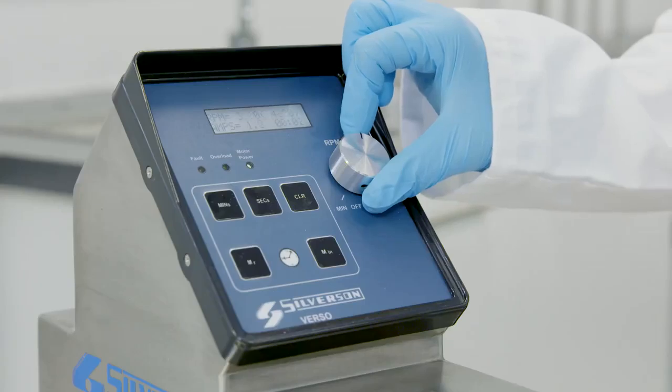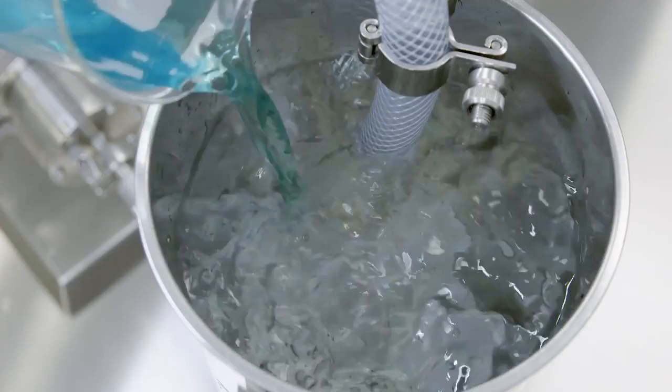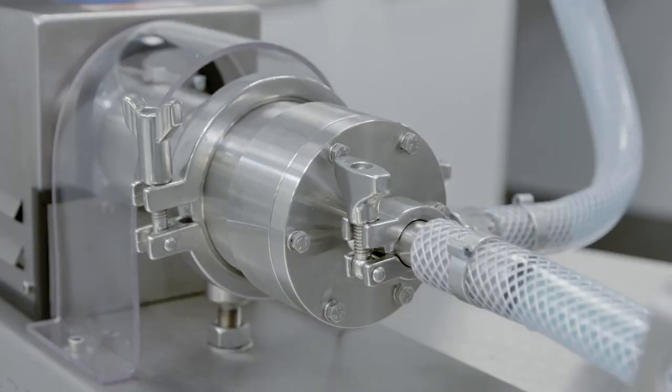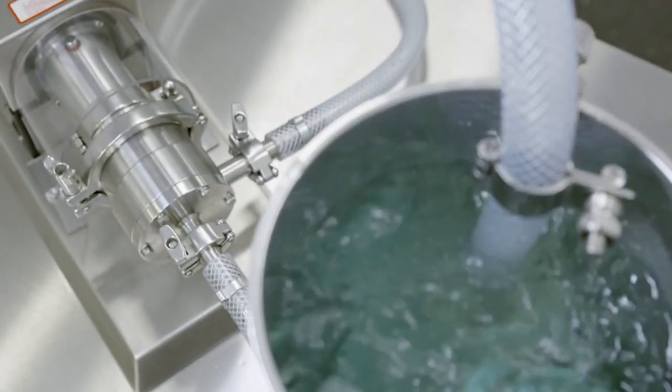The Silverson Verso is ideal for laboratory or pilot scale applications. It offers excellent reproducibility when scaling up and provides an accurate and easy method of forecasting the performance of Silverson's production scale in-line mixers.